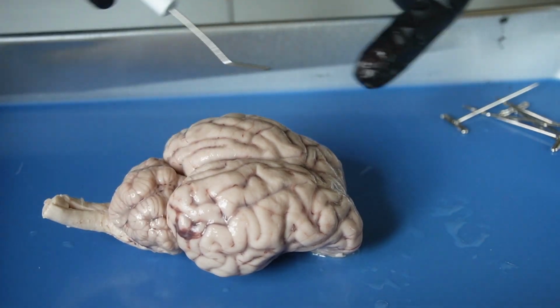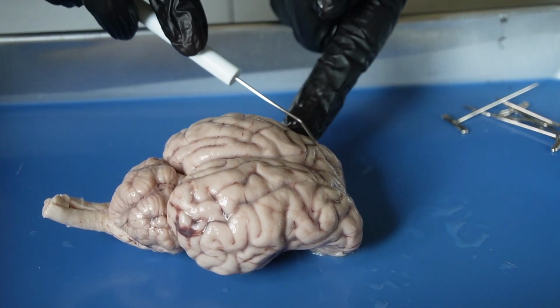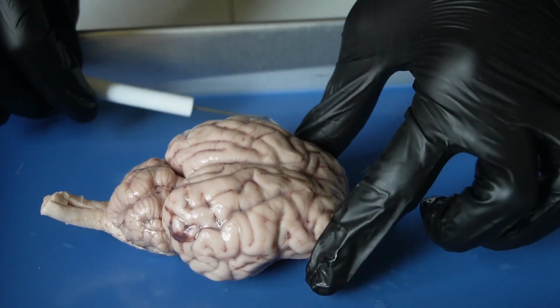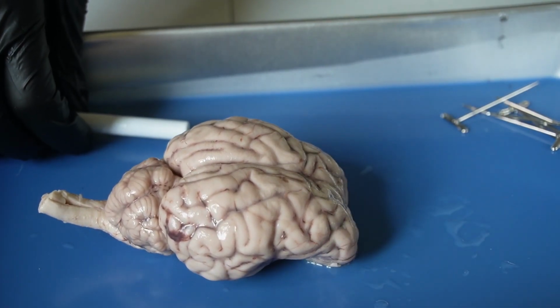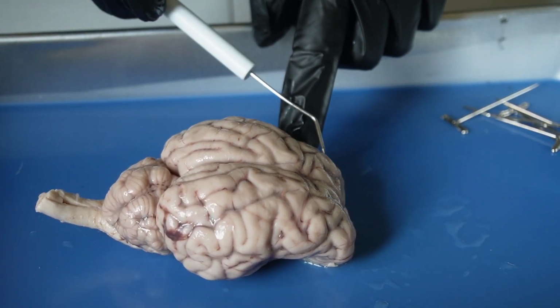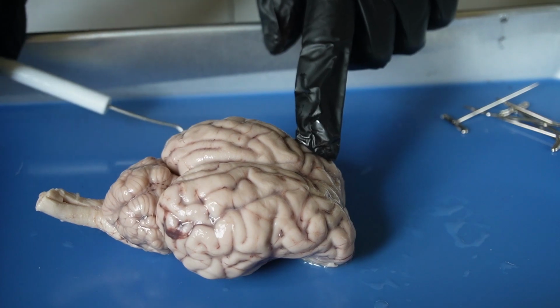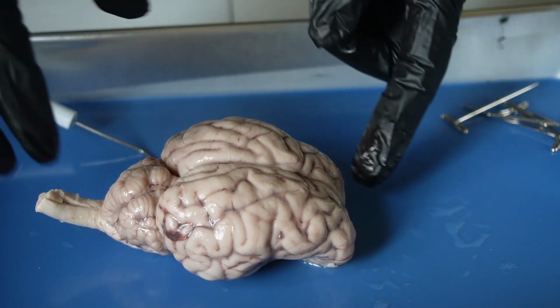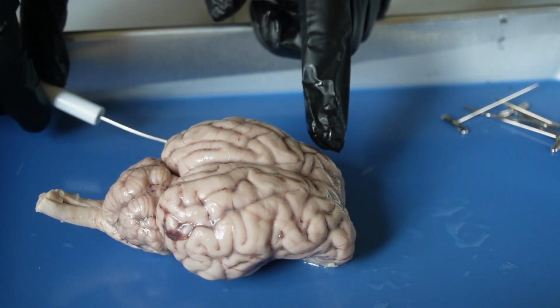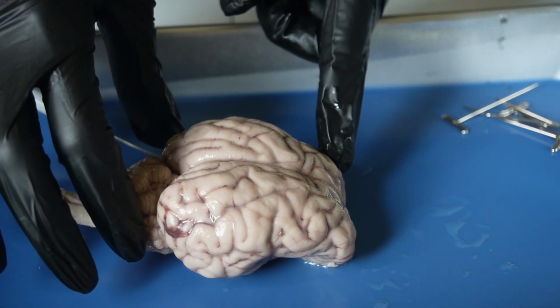So now I'm going to get into the different lobes of the brain. We have the frontal lobe, which is obviously in the front part of the brain here. The frontal lobe facilitates higher cognitive functioning, so that has to do with decision making, problem solving, as well as voluntary behavior, so behavior that we can control.